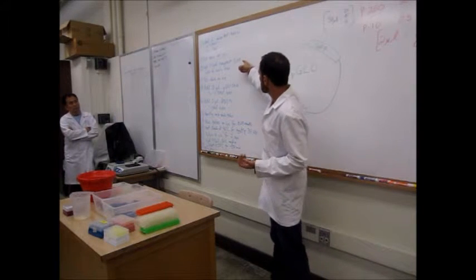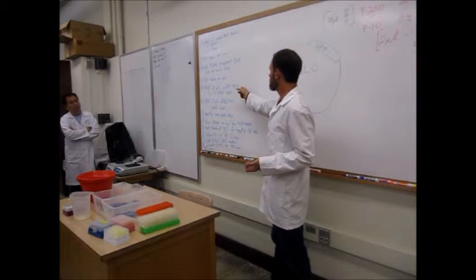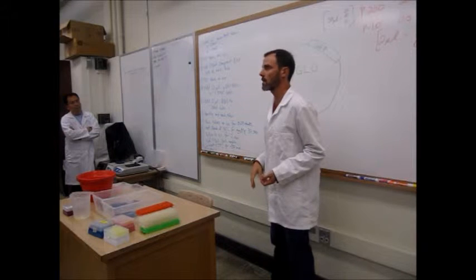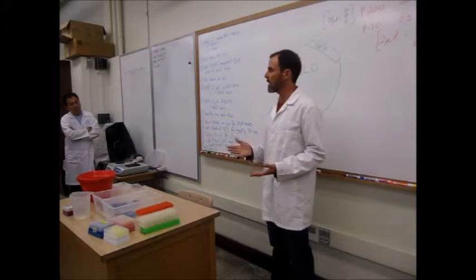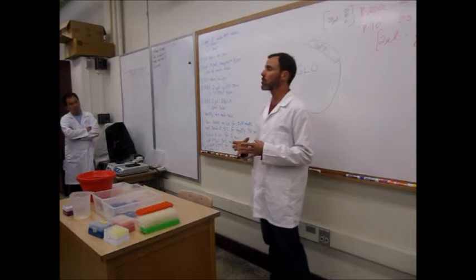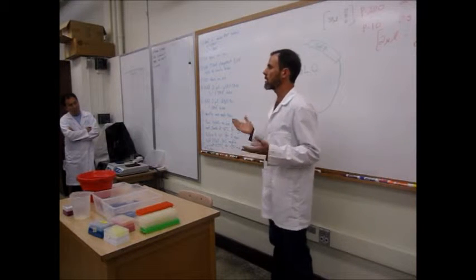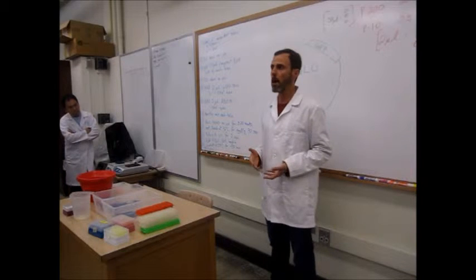We're taking hundreds of thousands of E. coli cells, mixing them with the DNA, and probably only a handful of the bacteria will actually get transformed. We're talking much less than 1% of our cells. If we were to plate them on nutrient agar, everything would grow, and the glowing green colonies would be lost in this huge lawn or sea of bacteria.